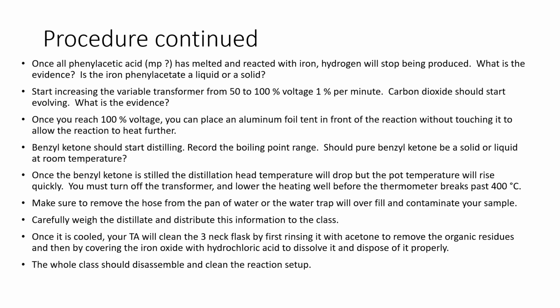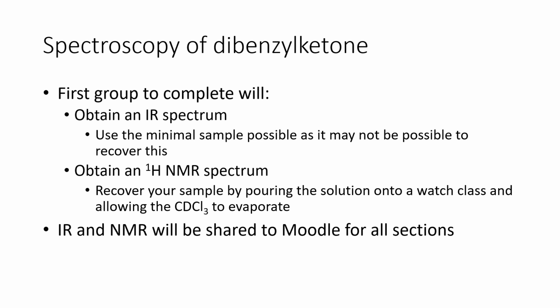And you can assist the TA in disassembling the apparatus during the experiment. Finally, the products will be analyzed using the most commonly used spectroscopic techniques, IR and NMR, and the results will be shared with you on the module, and you'll be able to see if you have synthesized the correct product or not.